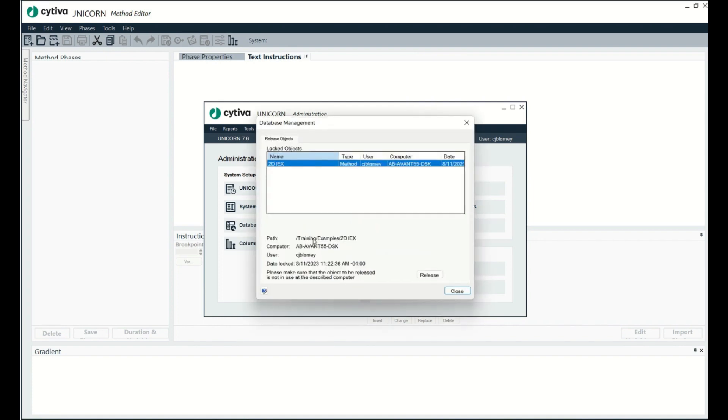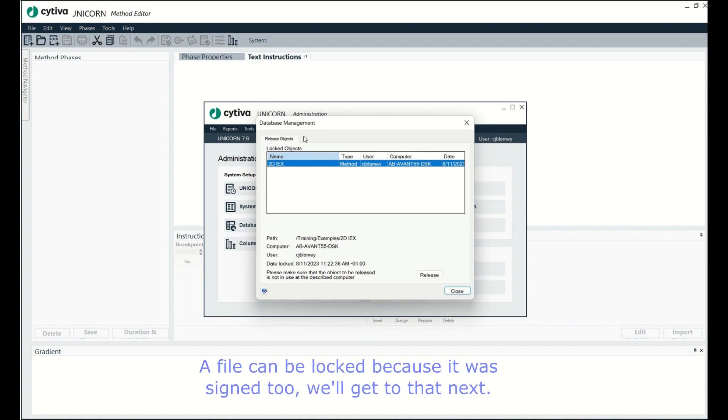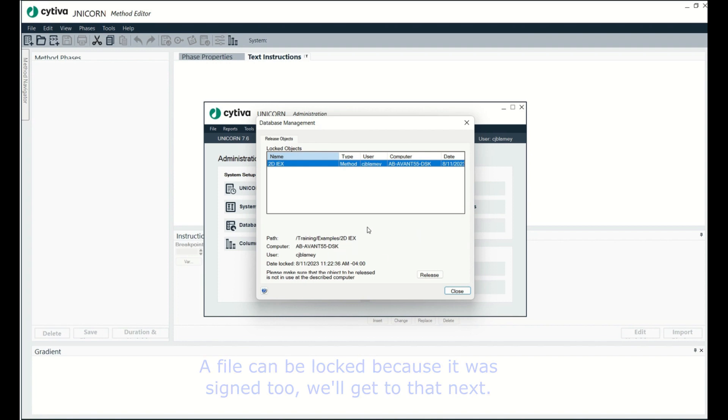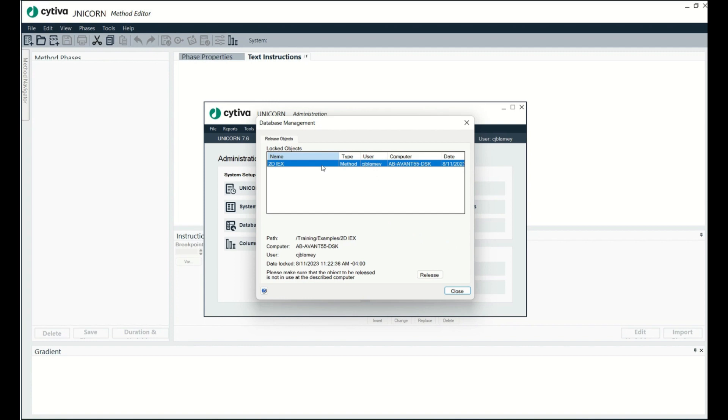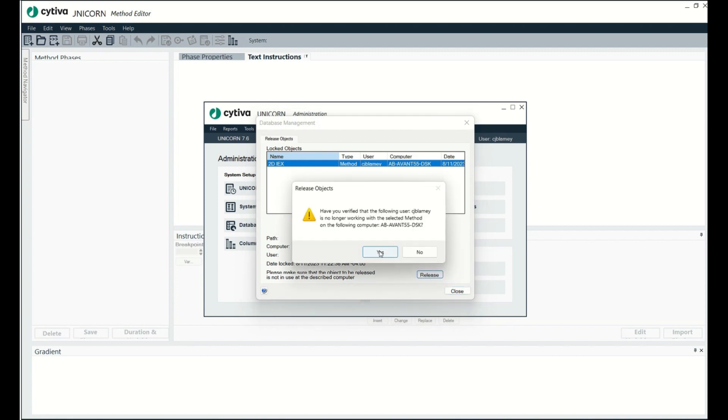Now what this does is it shows me all the files that are locked. A file could be locked because someone else is currently busy editing it, but I know for a fact that I am not editing this file right now. This is a different computer than I'm using, but I know I'm not over there editing right now because I finished working on this on Friday and I haven't been over to my computer. So all I'm going to do is highlight the file and click this button, release.